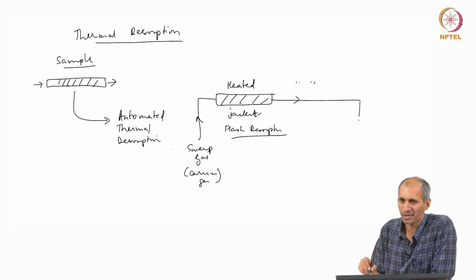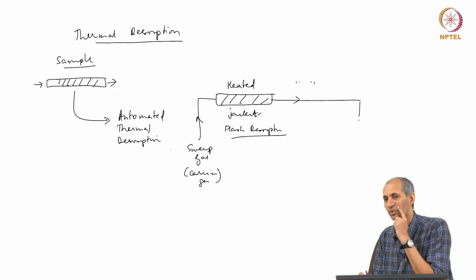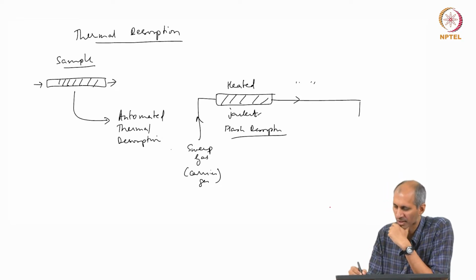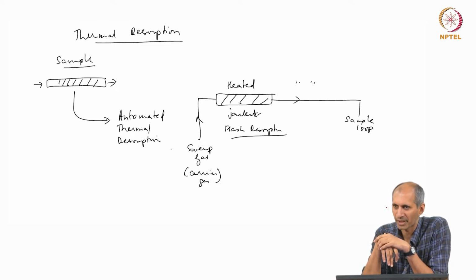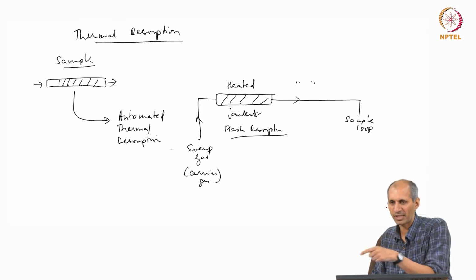How can it go into the GC? Now, GC has an accessory you can have when you are doing gas sampling. I did not discuss this there. When you do gas sampling, you can have what is called a sample loop. The sample loop is the holding place for the sample. You are sending in a certain concentration, and you would like this sample loop to hold all the sample that you are bringing.